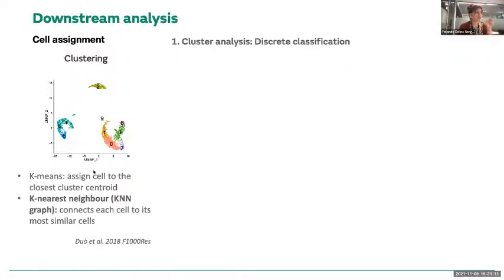And also, I want to say here that the number of clusters really depends on which resolution you use, and you can increase or decrease the resolution. So if you want more resolution, you will have even more clusters, and you can increase that until you have many, many, many different clusters that are very, very small, or sometimes they start to not be so well defined and they are starting to merge between each other. That's probably when you know that you have gone a bit too far with the resolution.